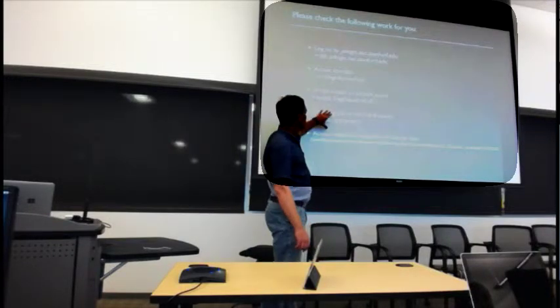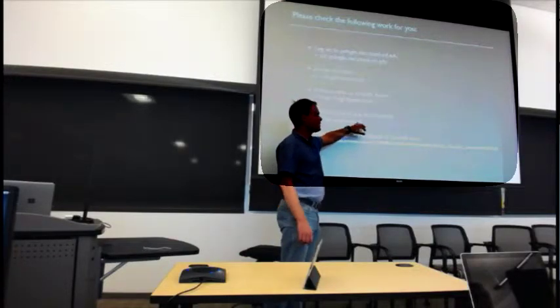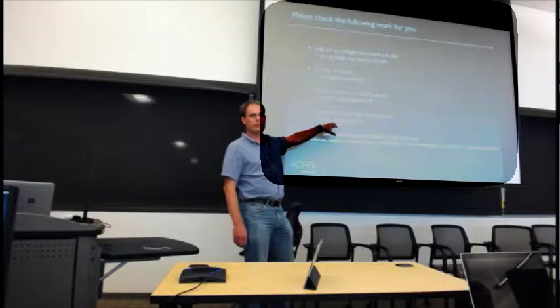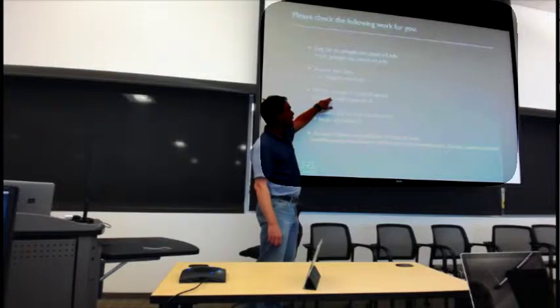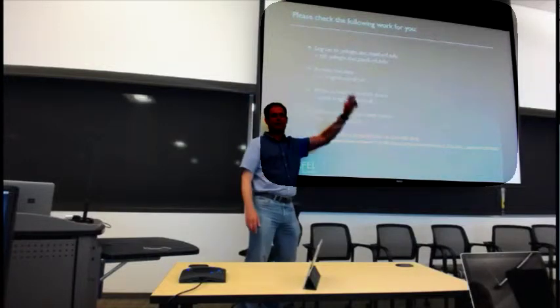You should be able to submit a job to the batch queue: bsub -q psanaq hostname or ls. Chris showed you that command yesterday. If this doesn't work, when you press the buttons in Cheetah to submit a job to the batch queue, it'll complain at you and tell you to go away. If you can't create the data, it'll complain and say I can't do anything, I don't have the permissions. And of course, if you can't get at the data, you're screwed.